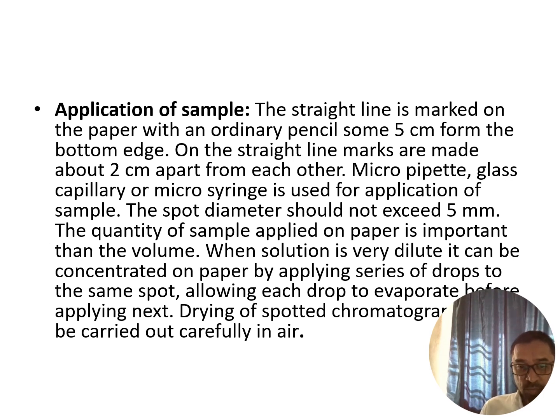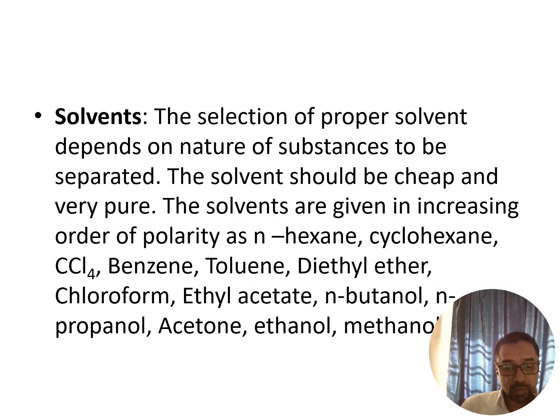Once you have applied the sample, wait for some time until the sample solvent gets evaporated, and then on the same place you need to apply the sample again. So it will give more concentration at one place, at the site of application of the sample.